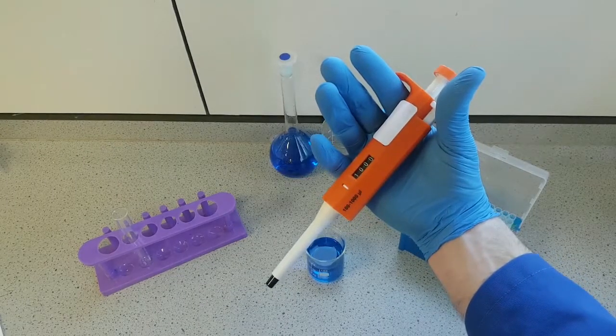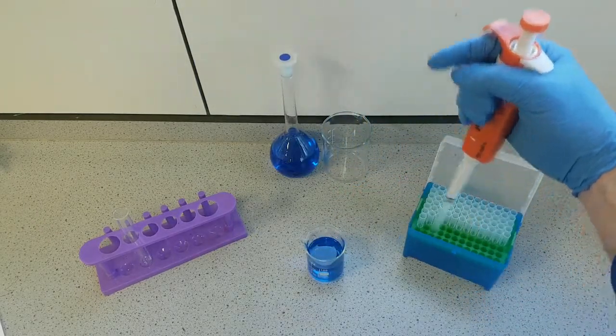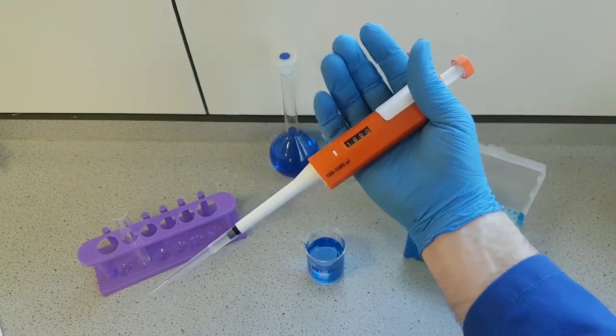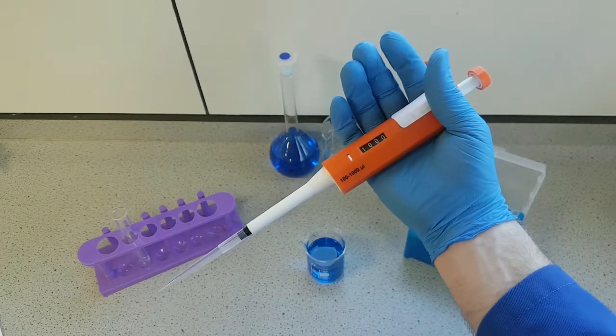Once we've set our pipette to the desired volume, we can now attach a disposable pipette tip. Make sure that you use a pipette tip that's suitable for the brand of pipette you're using, as well as for the correct volume.